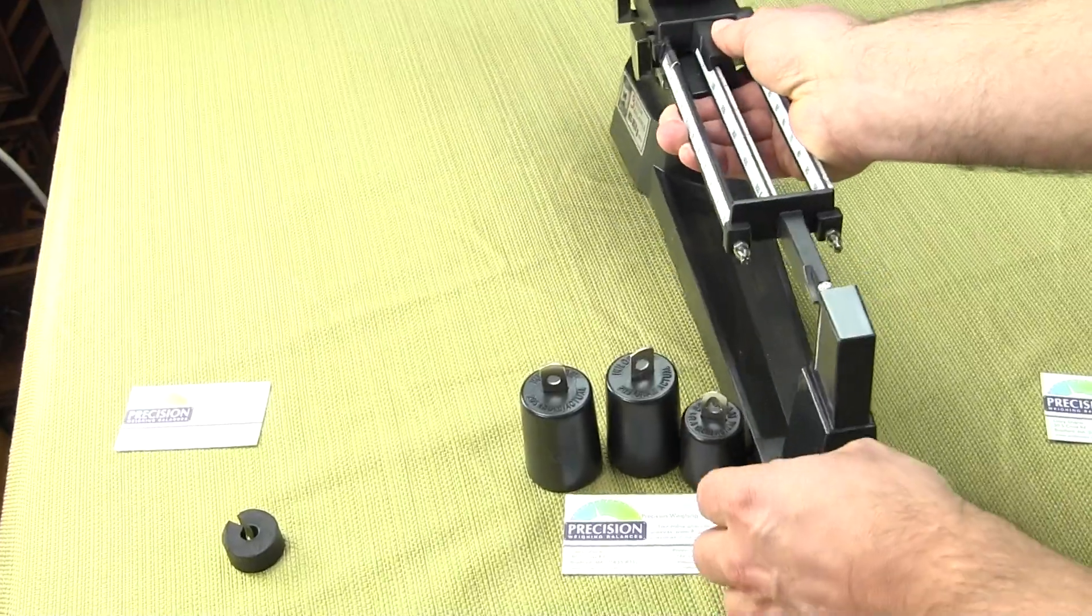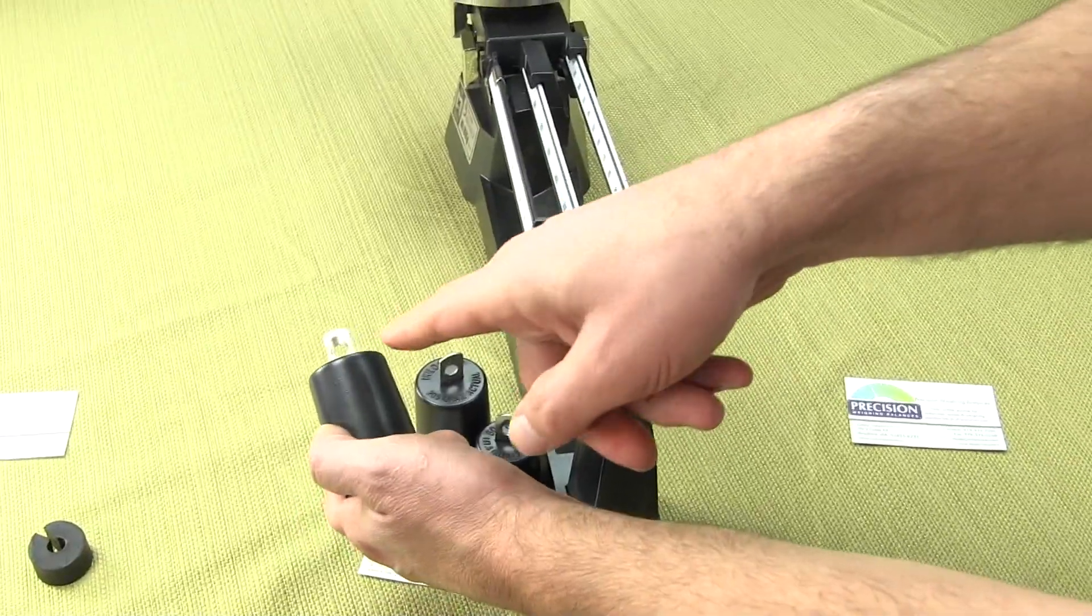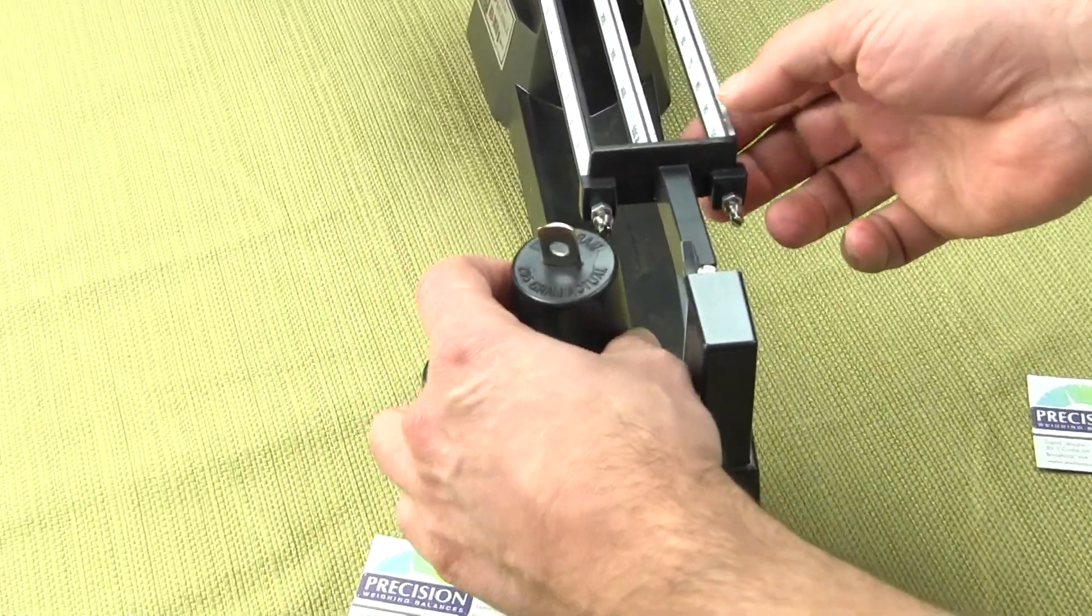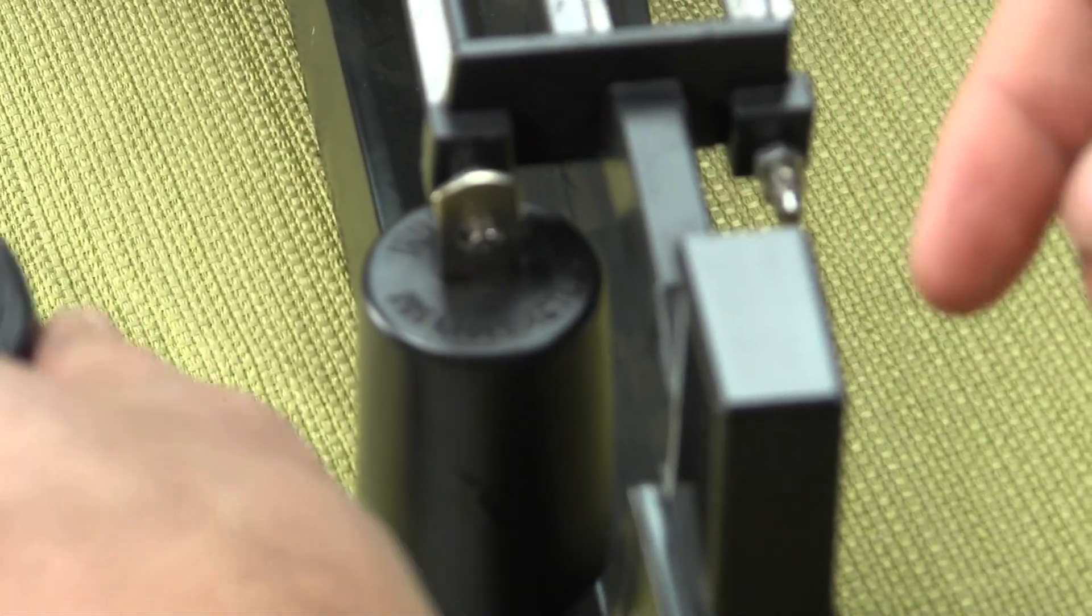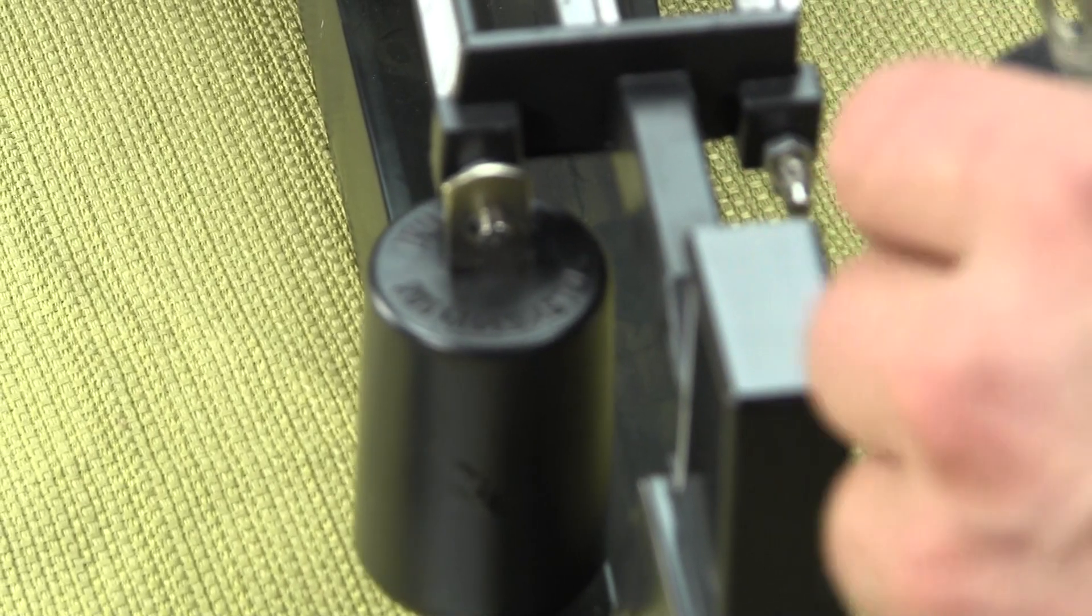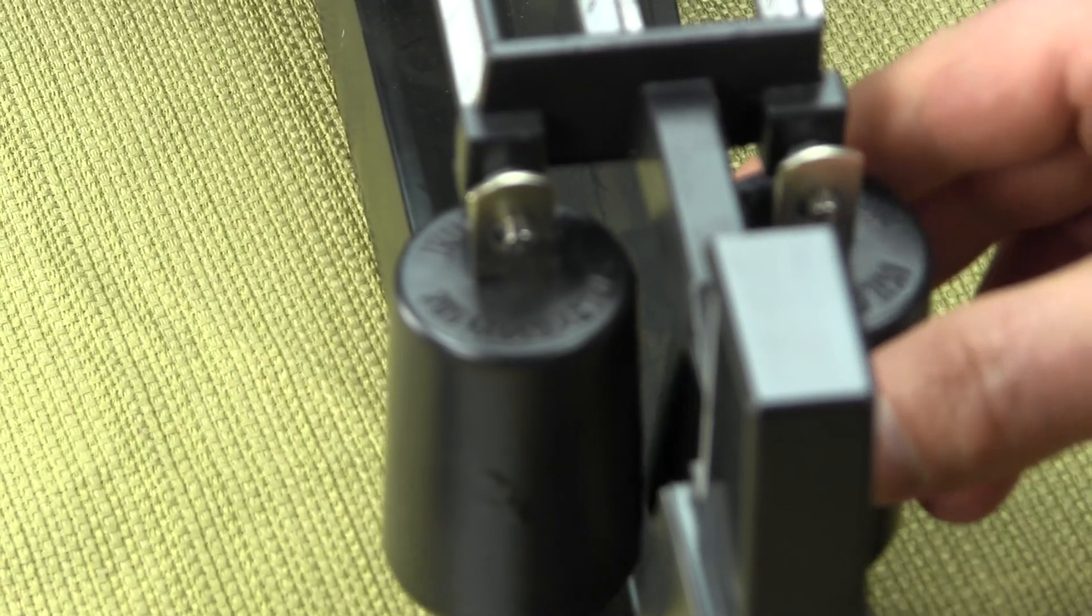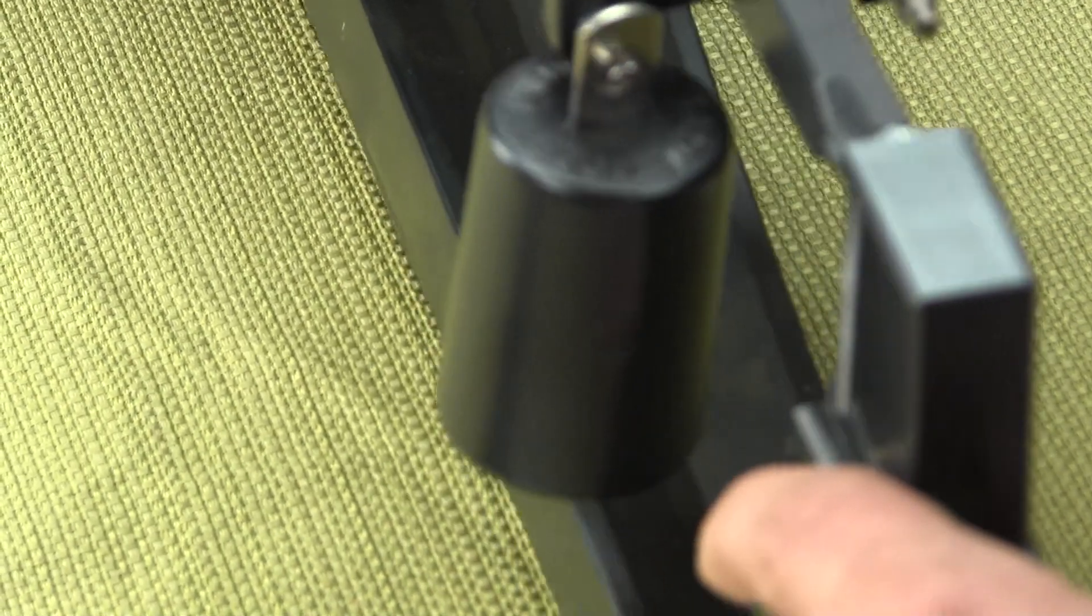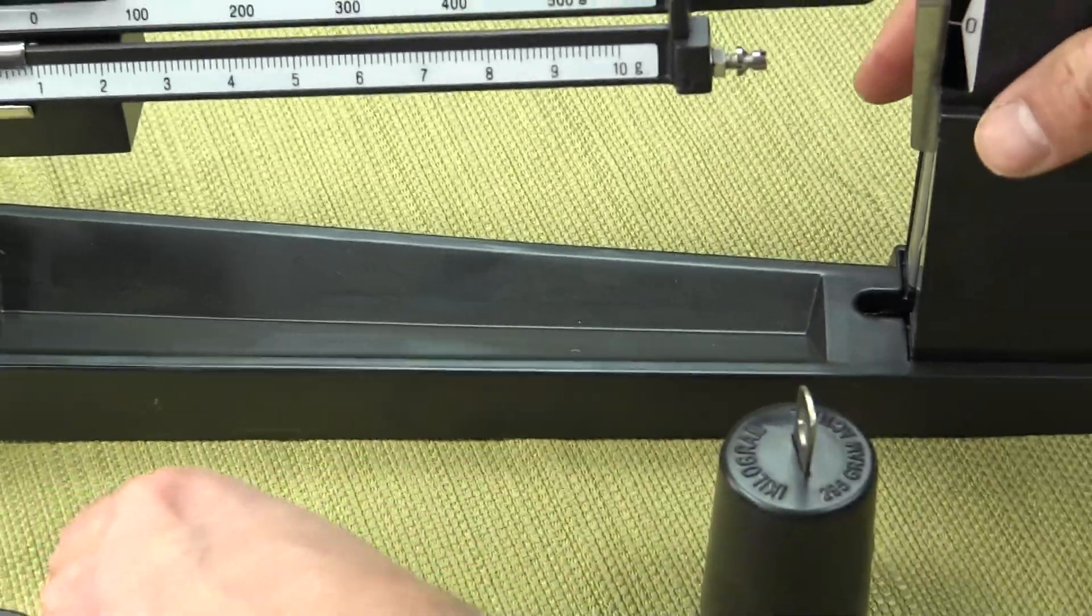These attachment weights go on the end of the beam itself. If we turn the balance, you'll notice that these attachment weights have been milled out. The attachment weights just fit right on the very end of the beam. If you were to put the 1,000, you'd be increasing the weighing capacity by 1,000 grams. You only can put two weights on. Even though you have three that it comes with, the most you can ever put on is two weights. We'll show you in this video how to use these weights.